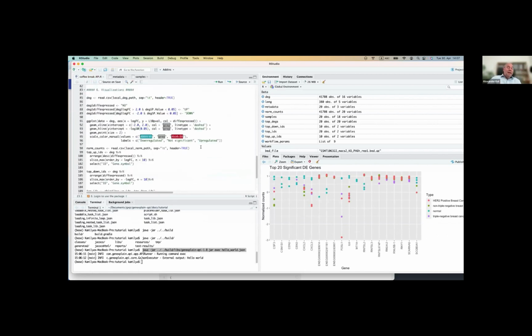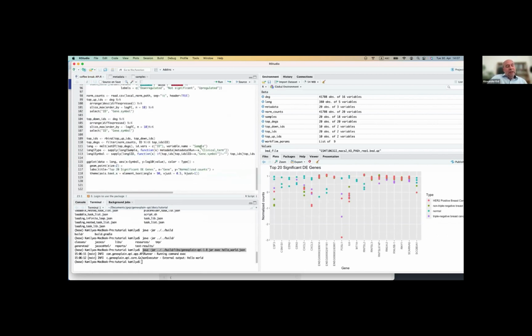Obviously, what you showed today is how to extend the possibilities of the data analysis which we have in platforms. Once I have an account in a platform, I can do many things, not only finding differentially expressed genes from the interface, but also very specific things.